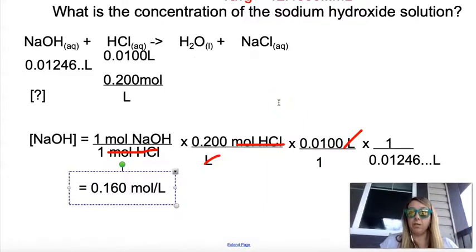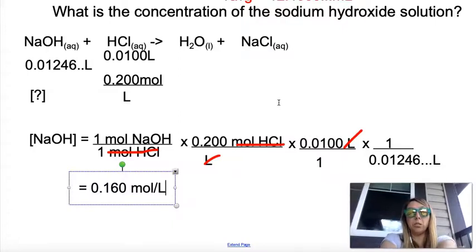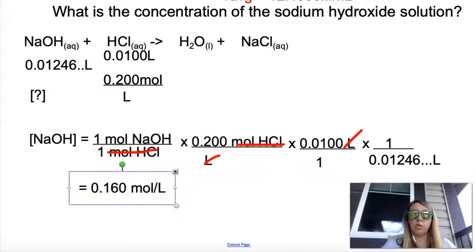either based on color. If it didn't give you color based off volume, you're going to average the remaining trials, making sure you recognize that that is always going to be in milliliters, what's giving you in that data table, never in liters. And then you're just going to do your little stoic calculation that looks exactly like the stoic calculations you did in solution stoic.